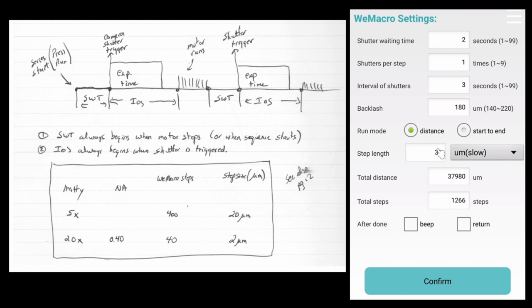One thing I had to determine is how many motor counts correspond to a certain distance that the focusing platform, when driven by the fine focusing knob, moves. I did that by putting a dial indicator on the platform and I found that I had 20 steps, motor step, per micron. So you get a lot of resolution with this setup. For example, for my 20 power setup, I like a step size of about 2 microns, and that corresponds to 40 steps. So here I have 30 set, which is about a micron and a half. Then if I use the 5 power Mitutoyo, I like about a 20 micron step size. Actually I tend to use a 10. So 20 corresponds to 400 steps, so I'd put 400 in here. I think the reason this all says microns, I think if you buy the Wii Macro controller with the linear slides that Wii Macro sells, then these units are in microns. But when I'm using it on the microscope, the units are steps.